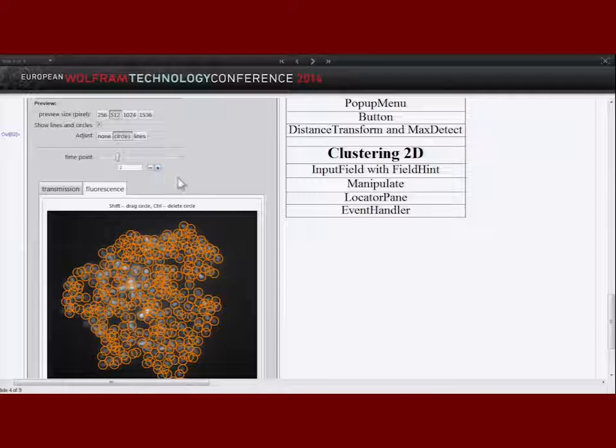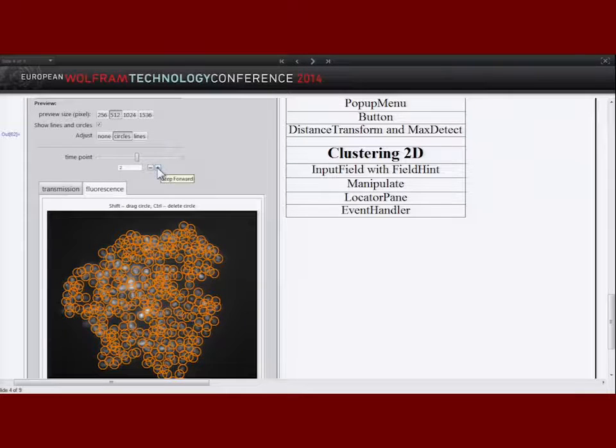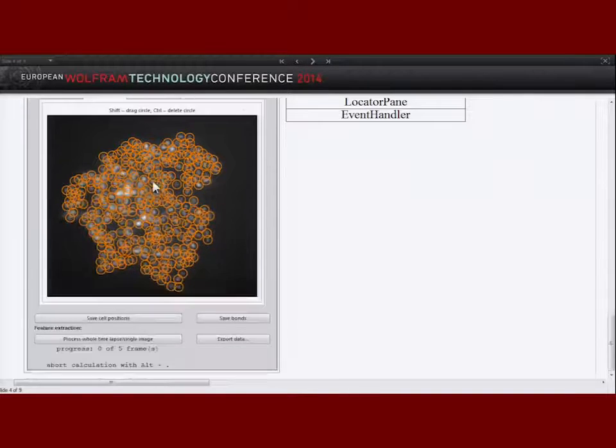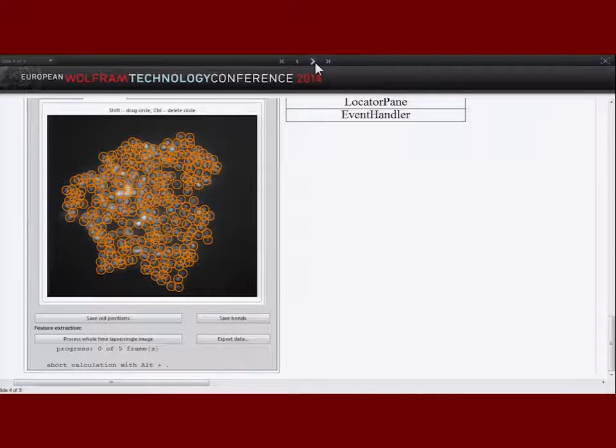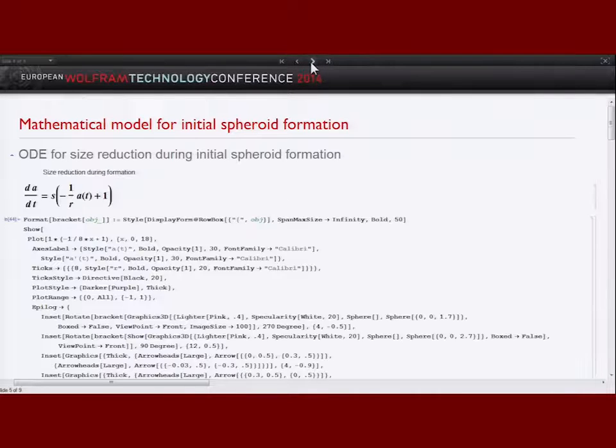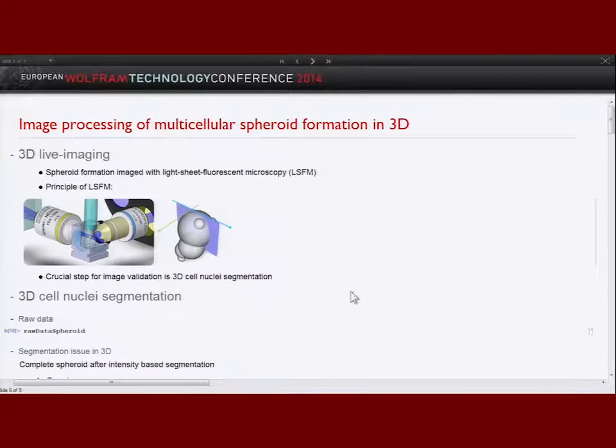This segmentation was done for all time points — the interface is wrapped around with Manipulate so we can go through all the time points.